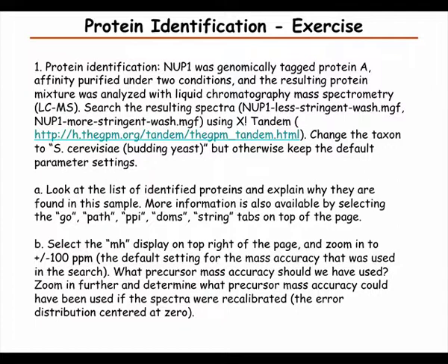In the other, they didn't wash very well, so we should see a lot of proteins. We will also see some nuclear pore proteins and some karyopherins, which are easy to understand. But then we'll see other proteins that you'll have to think about why they are there. We'll come back to this later.